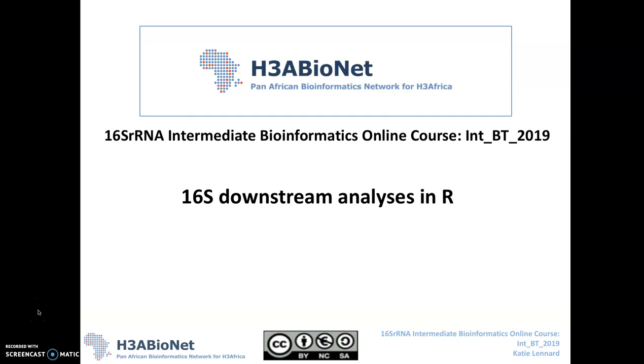So in the previous video lecture, we imported our data into R and we structured it into a phyloseq object. And in this session, we're going to use that phyloseq object and get to the fun part and do our downstream analysis in R. And that's going to involve exploratory analyses. So we're going to make lots of plots. And then after that, we're going to do some differential abundance testing.